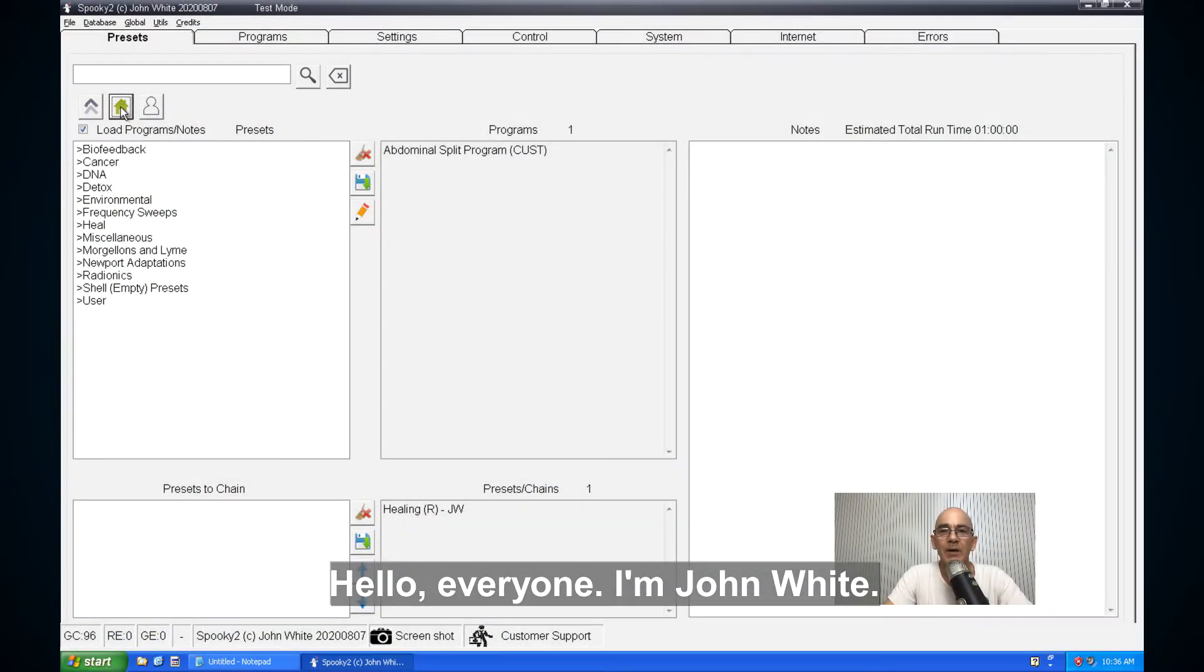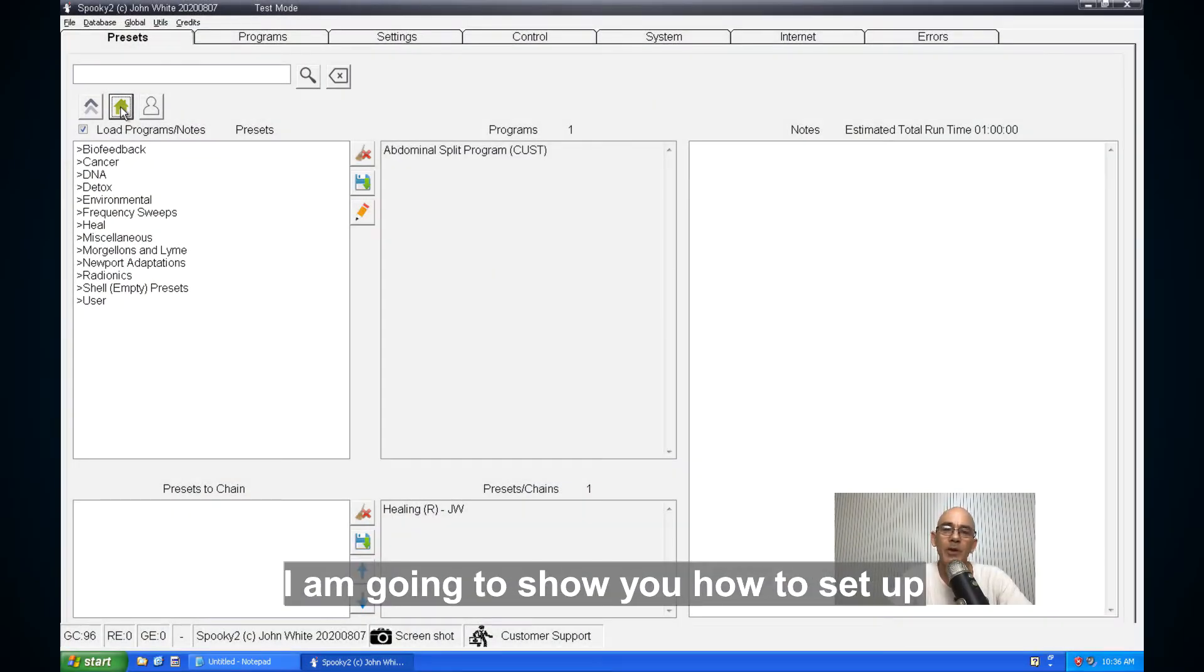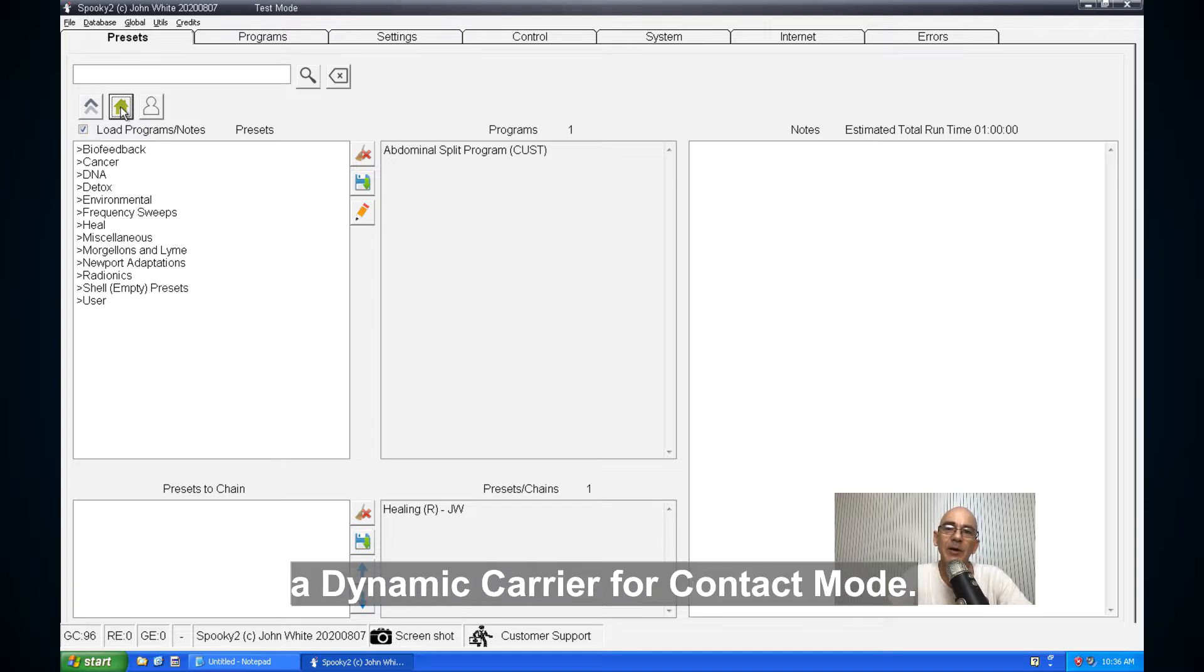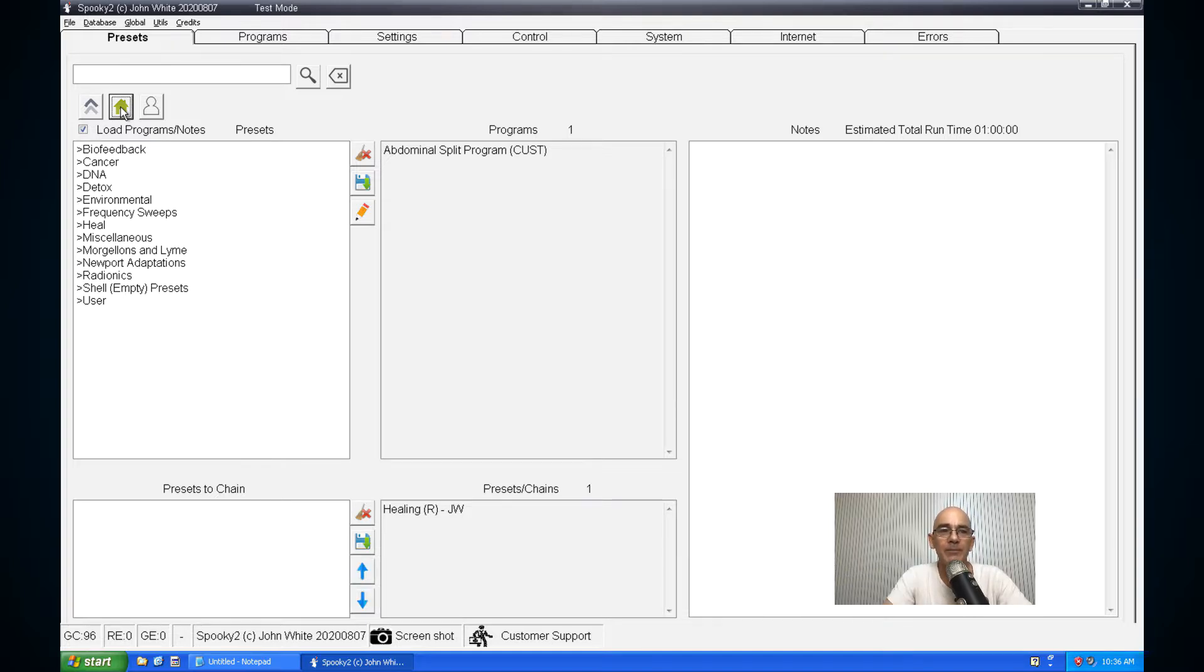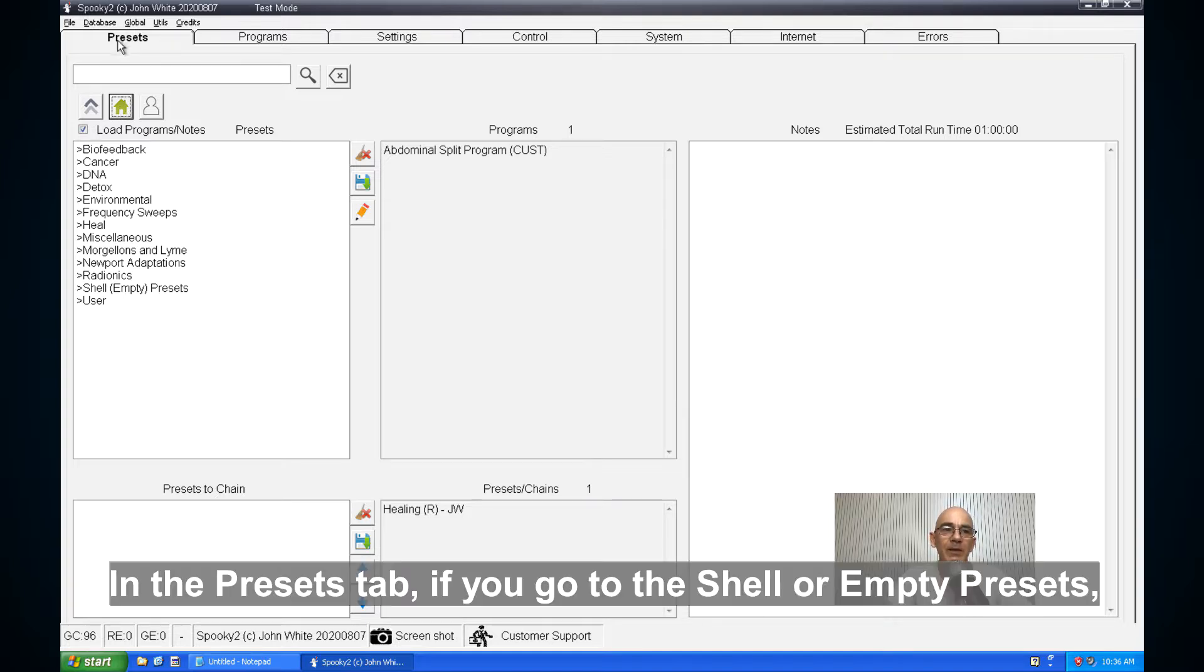Hi everyone, I'm John White. I'm going to show you how to set up a dynamic carrier for contact mode and the presets tab.